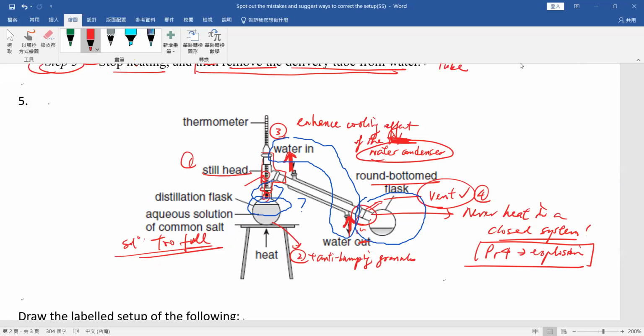Your Form 1 teacher taught you so well that you understand. "We'll just go into the condenser" is too vague. What do you mean by that? How? They will spurt out. You better use that term. Spill is not possible, not so good. Spill means something somewhat different. Okay, spurt out.